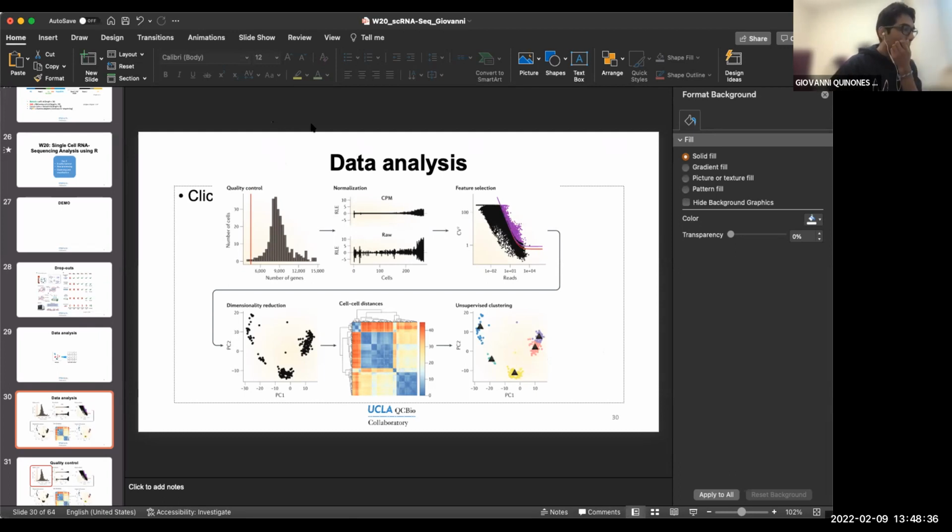Okay, so I'm going to share my RStudio with you. Oh, sorry, one last question. I shared a link to a Google Drive folder yesterday, which contained the code and the data set. So can we do one last show of hands? How many of you downloaded both of these files? Great.